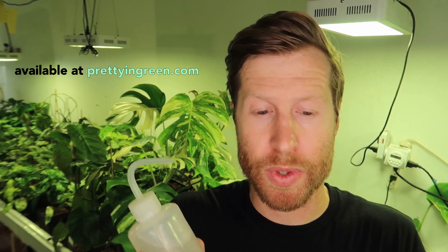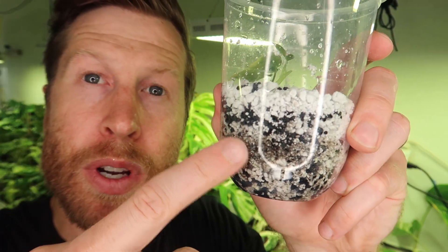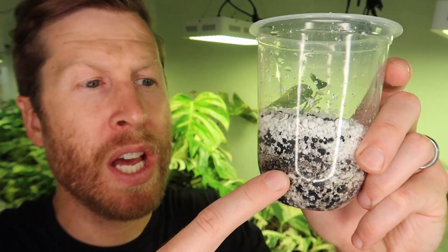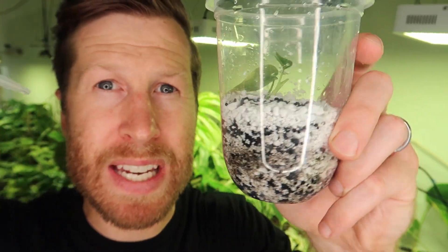I found these squirt bottles to be super useful for taking care of tissue culture. This is about 20% strength AB nutrient, and I'm going to gently acclimate this plant now that it has a little bit of roots — simply squirting in a little bit around the plant. I'm checking that the stratum and perlite aren't overflowing with water. We want it damp but not wet.